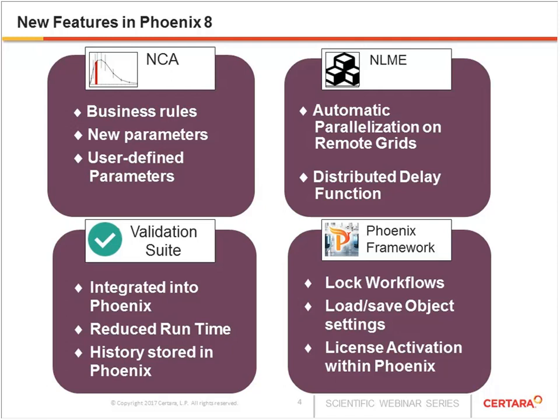The same thing with plots. If you have an XY plot that you like a certain way with labels in a certain direction and certain font size, you can pull those up directly, again, with one click to select the object settings that you want. And so I can demonstrate that later.